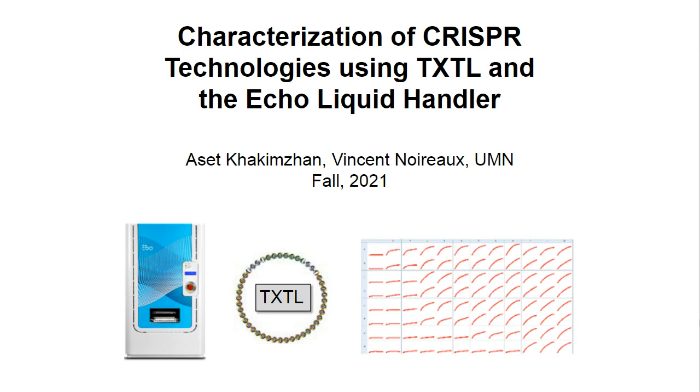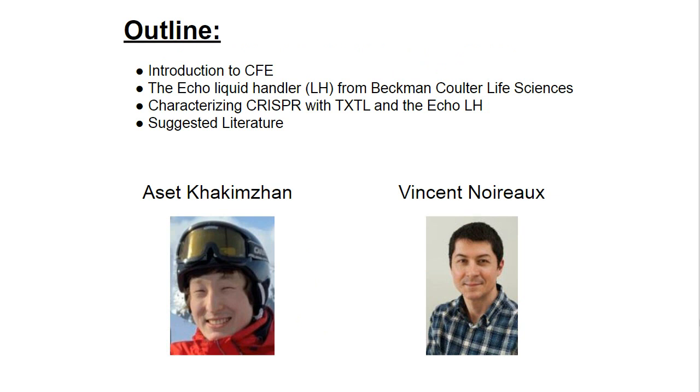This webinar will cover the four following parts. First, I will introduce cell-free gene expression, a relatively new technology to do some synthetic biology and bioengineering in vitro. I will then introduce and present the Echo Liquid Handler from Beckman Coulter Life Sciences. And then Aset will cover the third part on characterizing CRISPR with TXTL and the Echo Liquid Handler. And we will conclude this webinar with some suggested literature.